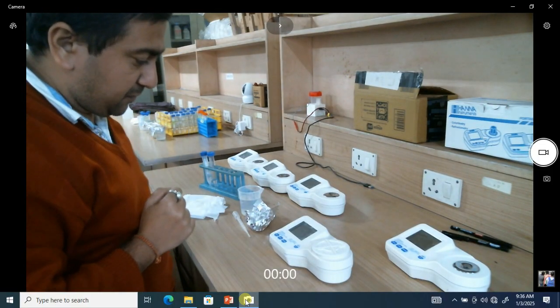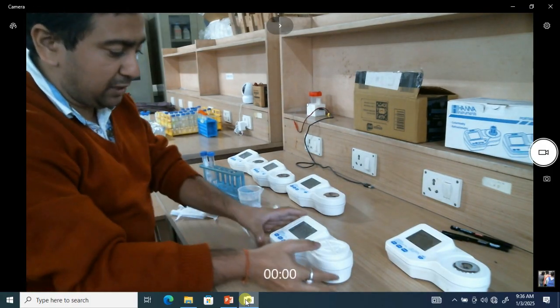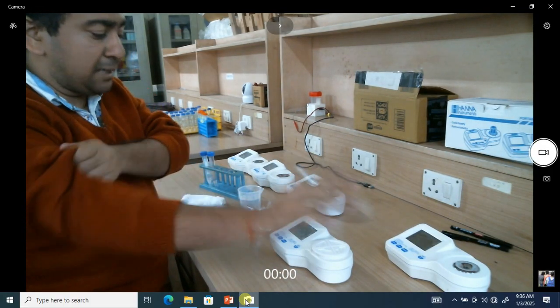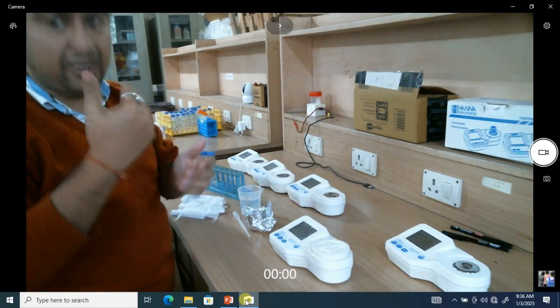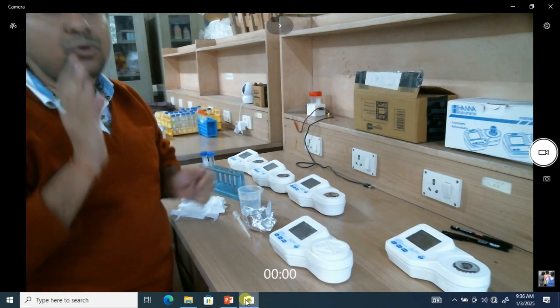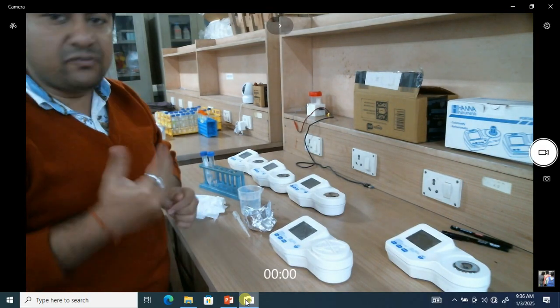You see that it's coming as 1.3342. That means the refractive index of the particular solution that we are trying to measure is 1.3342 ND. That is the refractive index. So in this way, we can measure the refractive index of any sample.